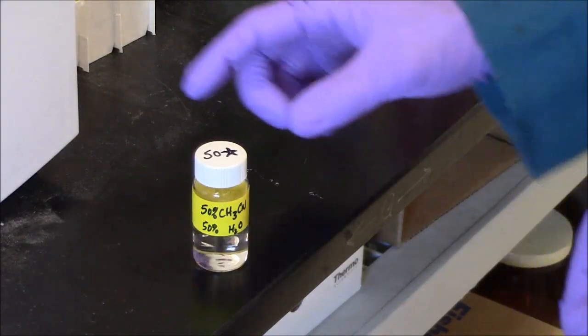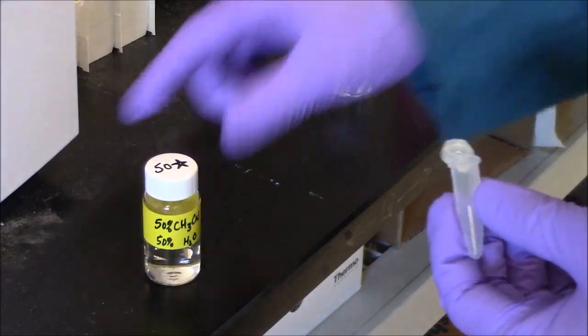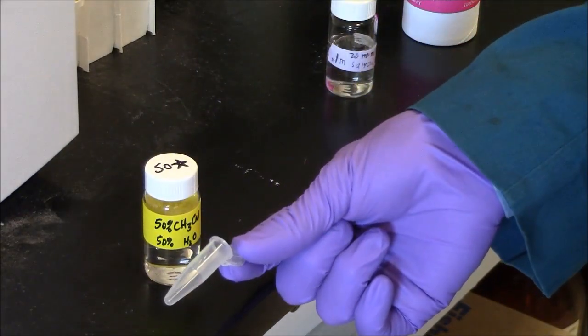For the esters, the recommended diluent will be 50-star, 50% water, 50% acetonitrile. And I'll make the dilution in an Eppendorf tube.